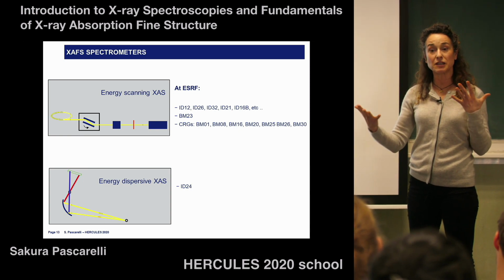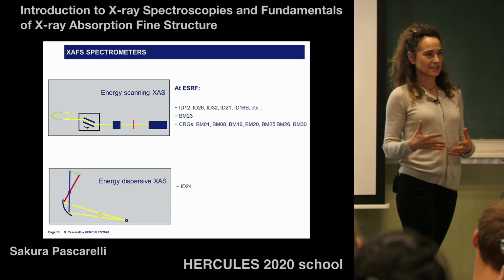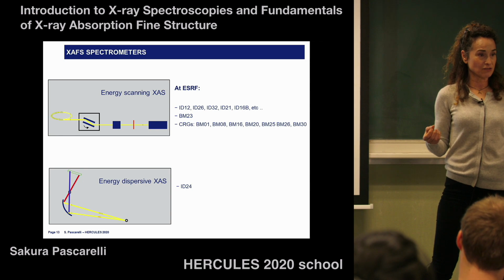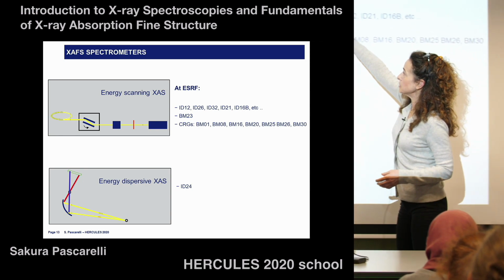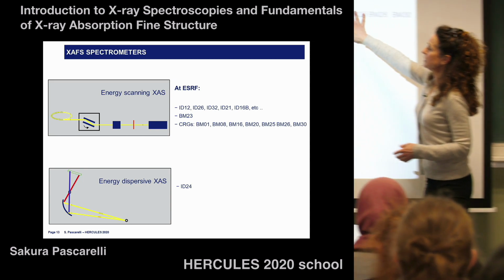But it's really important to do both in a facility. Something like this will really push the possibilities of the methods that we do. For example, the fact that now we can do a spectrum with just one bunch, right? This is really special, and we can do it on ID24. But you really need beamlines like this that produce a lot of science and get the community here. And then we have many CRG beamlines.